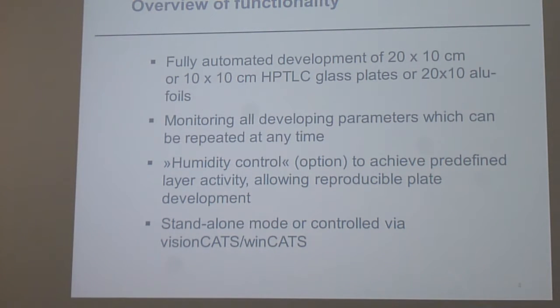Temperature we cannot control, but we say, okay, in the laboratory there should be something like a normal temperature. But we also had customers where water was dropping from the walls, and temperature was dropping at night to really low temperatures, and during daytime they had 25 or 30 degrees. So in such an environment, to work in a qualitative or quantitative way is rather difficult.